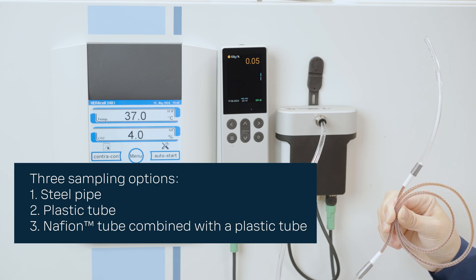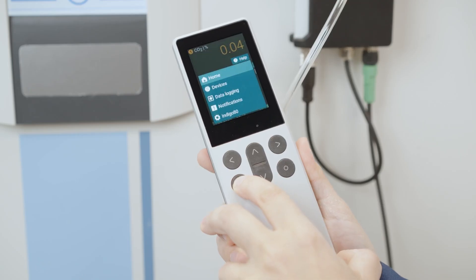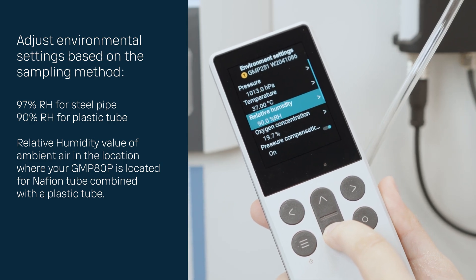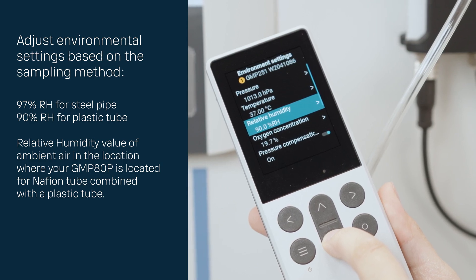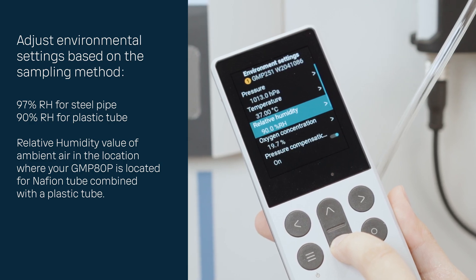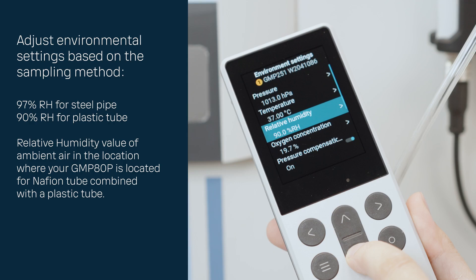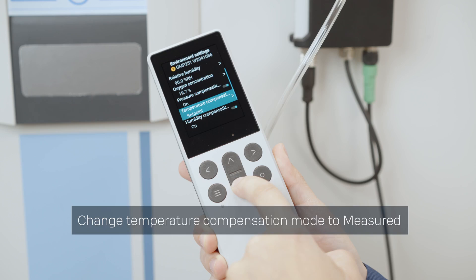In this video, I will show how to do it with the Nafion tube combined with the plastic tube. First, we need to adjust environmental settings based on the sampling method. Relative humidity set point depends on what sampling method you are using: for a steel pipe it's 97%, for plastic tube it's 90%, and for the Nafion tube combined with the plastic tube, use the relative humidity value of ambient air in the location where your GMP 80P is located. Next, let's change the temperature compensation mode to measured.